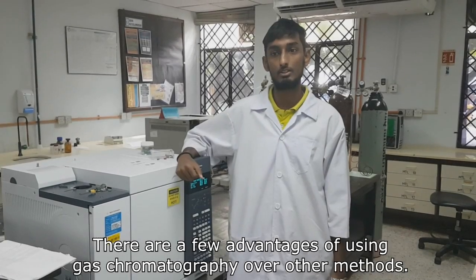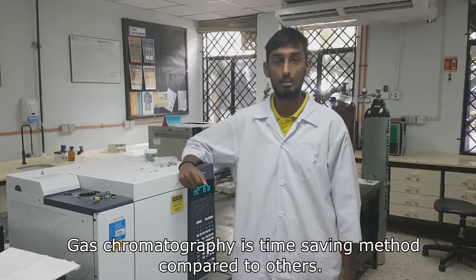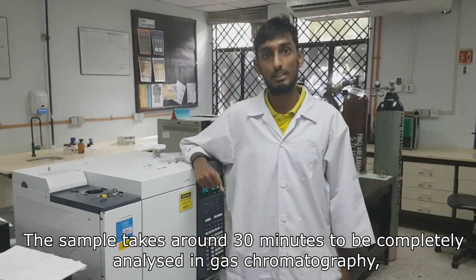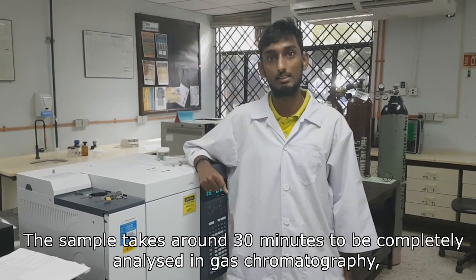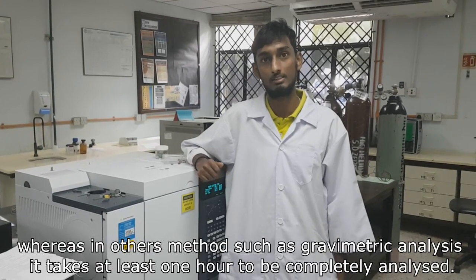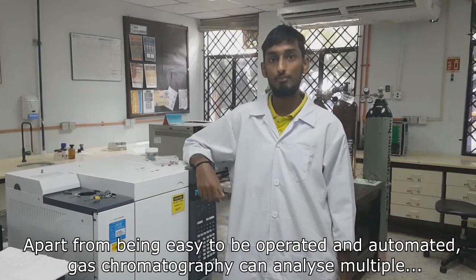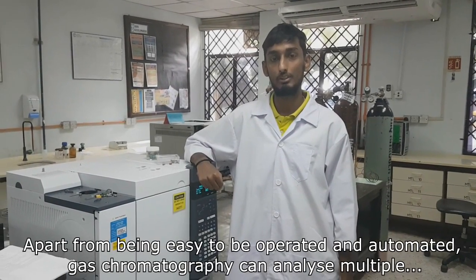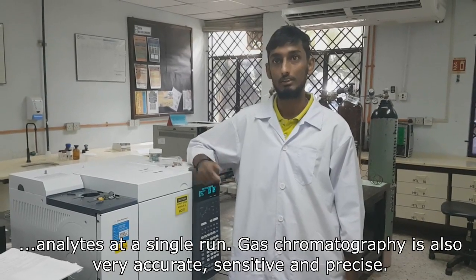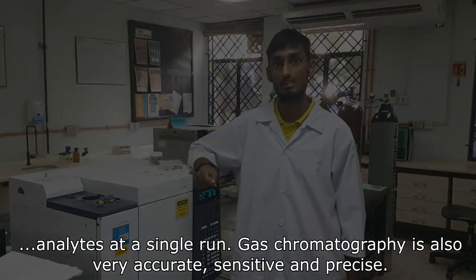There are a few advantages of using gas chromatography over other methods. Gas chromatography is a time-saving method compared to others. A sample takes around 30 minutes to be completely analyzed in gas chromatography, whereas in other methods such as gravimetric analysis, it takes at least around 1 hour. Apart from being easily operated and automated, gas chromatography can analyze multiple analytes in a single run. Gas chromatography is also very accurate, sensitive and precise.